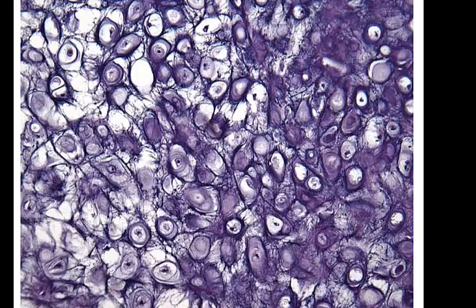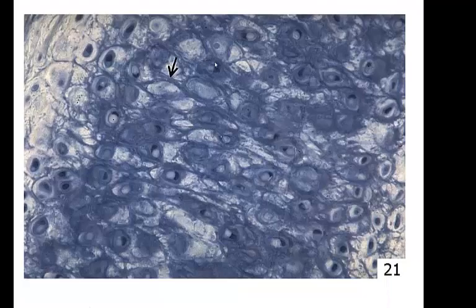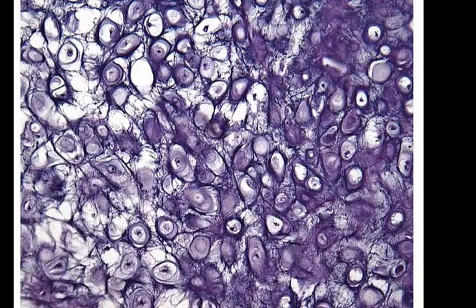This is a much better picture because you can see all the elastic fibers in the background. And here's a set of owl eyes here because they have very narrow little piece behind them. But elastic cartilage pretty much always looks like this, or like this.